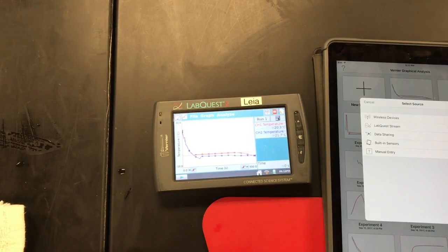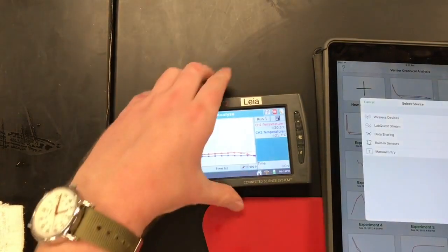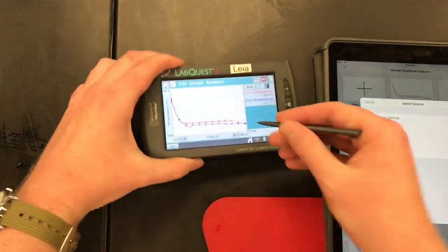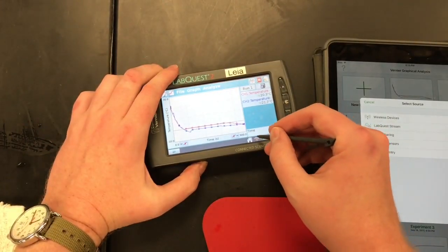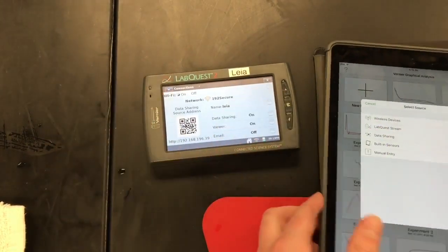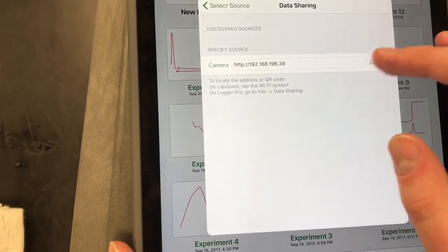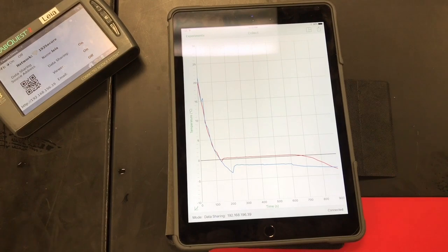Okay, so I've cleaned off my whole lab station, and I'm ready to look at my graph here. So again, it should look something like this. I'm going to go ahead right away and connect this to Graphical Analysis. All right, a couple quick things here. Our red line is our fresh water, so that means our blue line is our salt water.